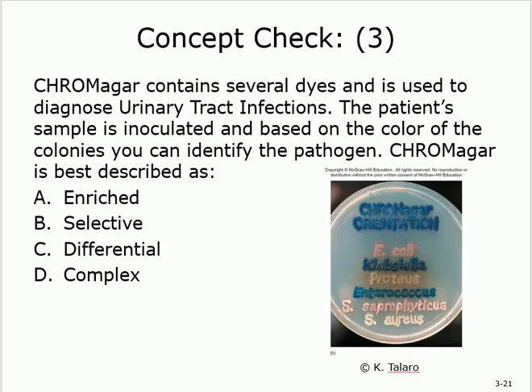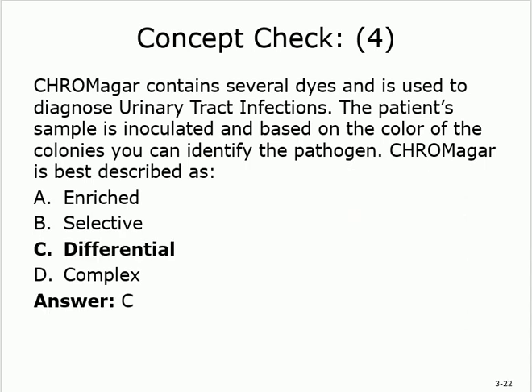So what is it? Differential, yes. See how it's giving you different shapes? You can tell the difference visibly. It's a visible change. So yes, this is a differential one. Okay, so this is for chapter 3.